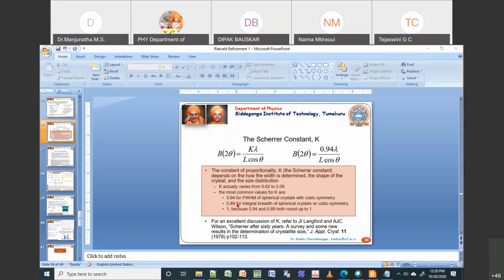Normally this will not make a big difference, but if you give this explanation, your reviewers would appreciate your effort. They know that what you are doing is not blind, that you are doing it professionally. I have given some references also. You can go through these references and get more idea on this scale. I just extracted this from this paper; I didn't put it in myself.